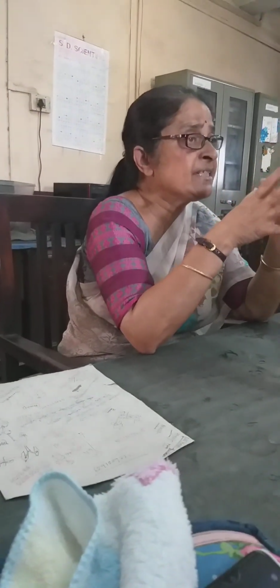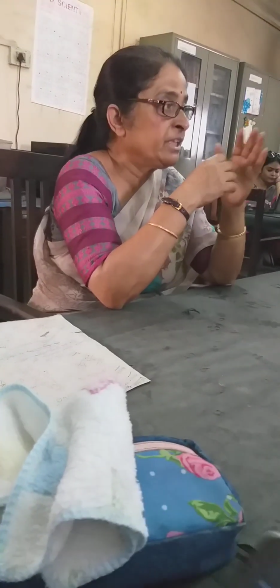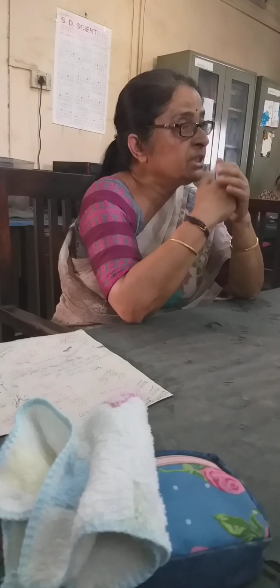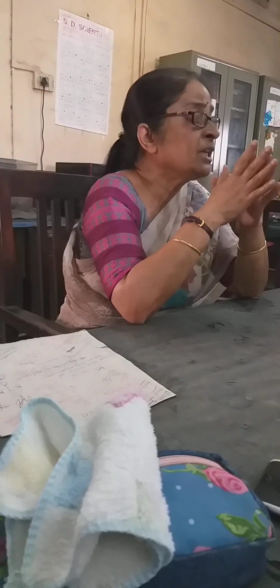তাহলে এবার যখন আমাদের এই সোর্স অফ মেডিসিন অর্থাৎ আননোন সোর্স, মানে আমি জানি না কোথা থেকে আমাকে দেওয়া হয়েছে, whether it is from the root, whether it is from the bark, whether it is from the leaf, we do not know. But we have to analyze. So how we could analyze? Only with the help of compound microscope or electron microscope.